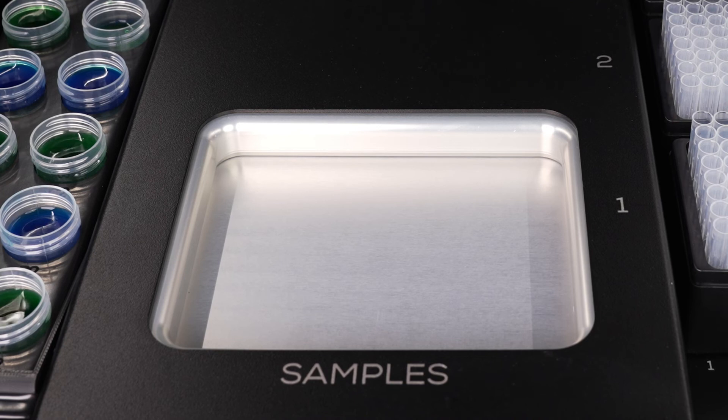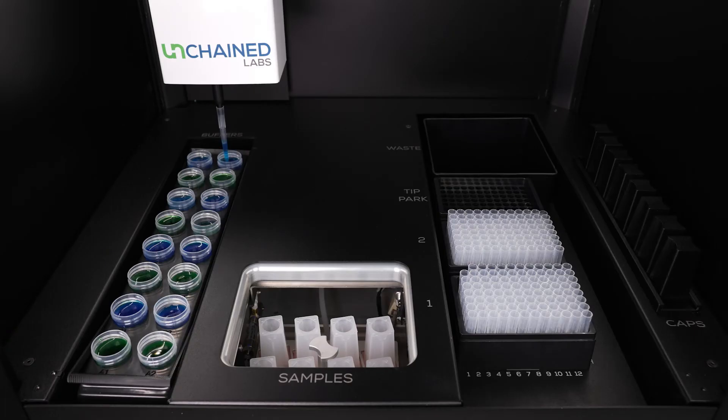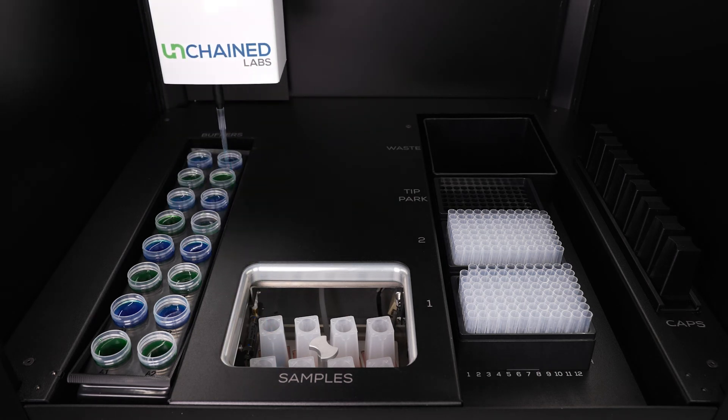Unagi kicks things off by measuring the volume of each sample. The buffer exchange chamber closes and will apply even positive pressure at 15, 30, or 60 psi for each cycle to remove filtrate. Unagi will then add the new buffer to your sample. This cycle is repeated until your target exchange or concentration values are reached.